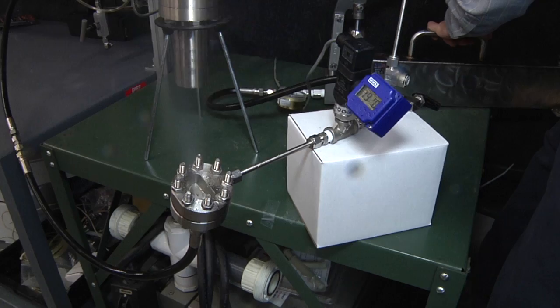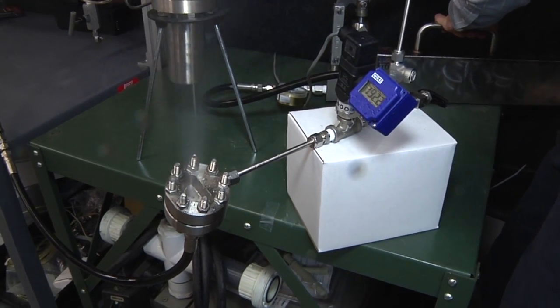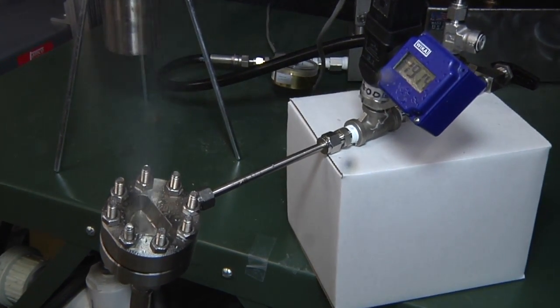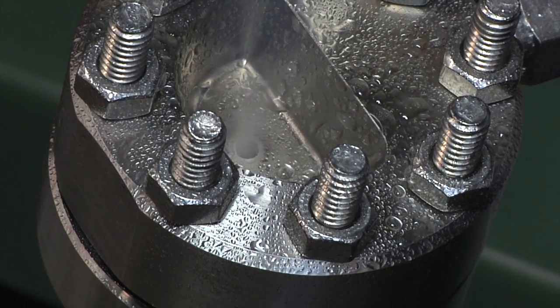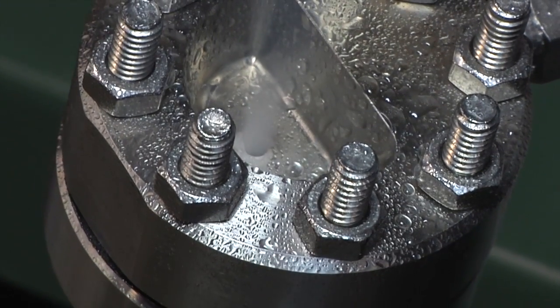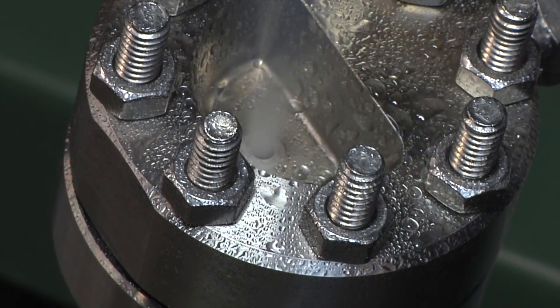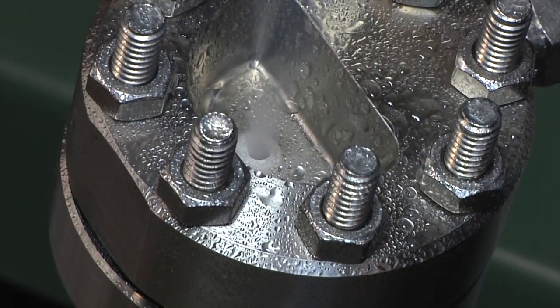So this really demonstrates the Equilibar's VPR technology with this BR1 pattern orifice. As we're pumping water through the system, you can hear the crackling of the ice surface as it forms and sheds away from that expanding orifice.